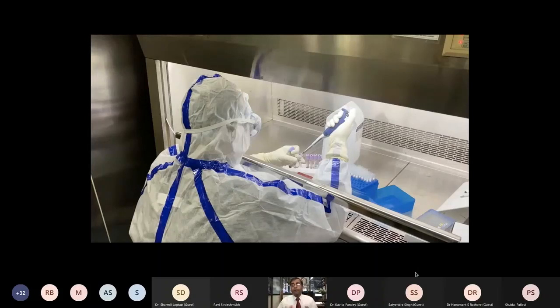So please keep in mind that many of these things I'm talking about are the real practicality, not just a lecture. The practical issues are very important because your cost is very prohibitive for doing a large number of samples. So discovery work can be done on maybe a smaller set of samples, 30-40 samples, for which you can buy these kits.